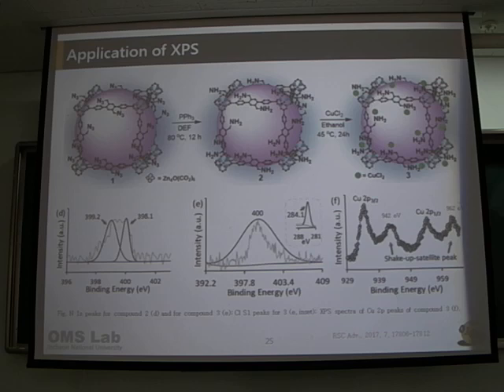But what he was trying to say is that the copper 2 chloride for some reason can be changed. The oxidation state of copper 2 can be changed to copper 1. But then the reactivity of copper 1 is not as reactive as copper 2. So he just wanted to show that the oxidation state of copper 2 has been retained even after the coordination. So the reactivity is still active.